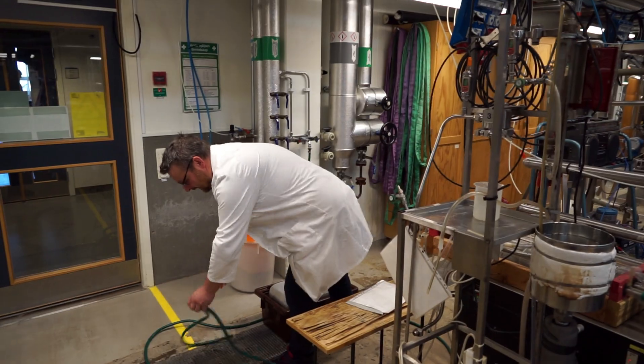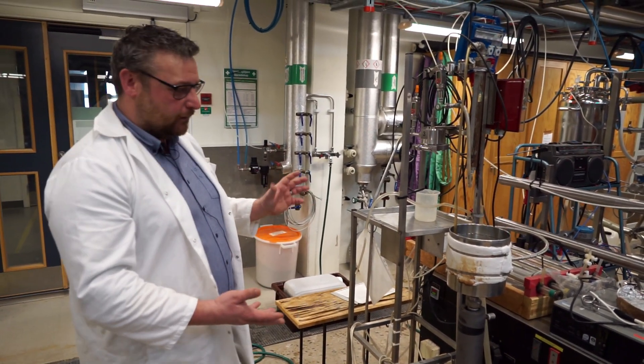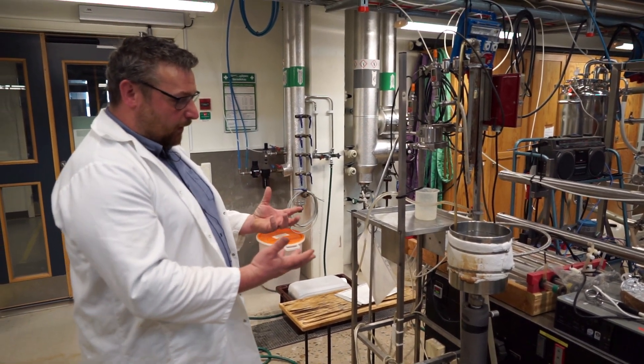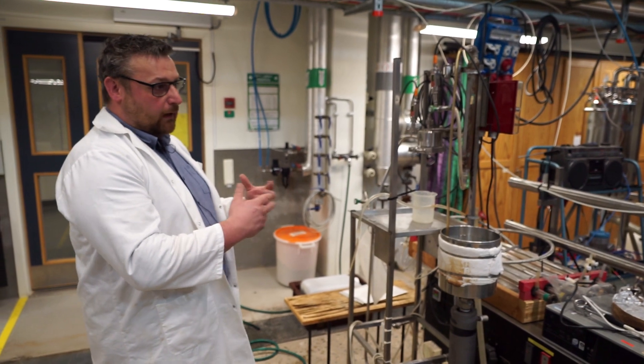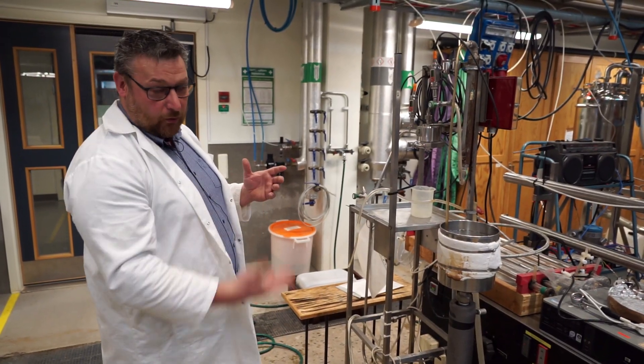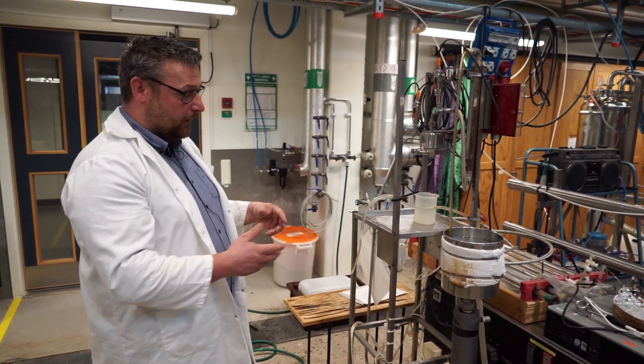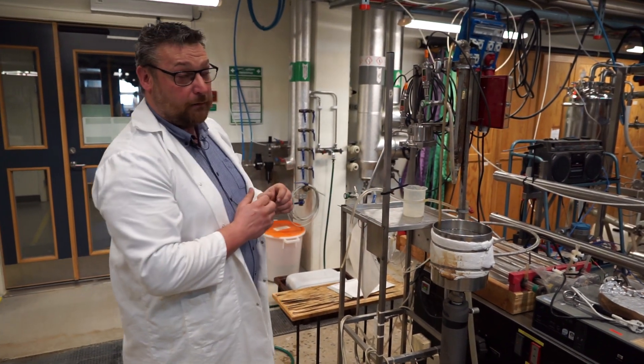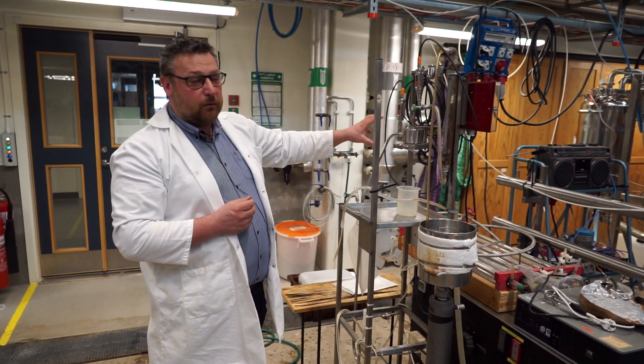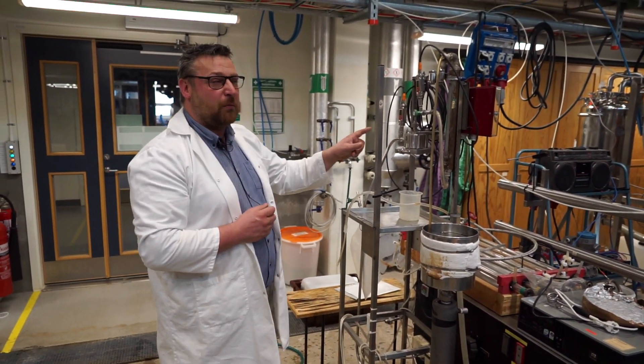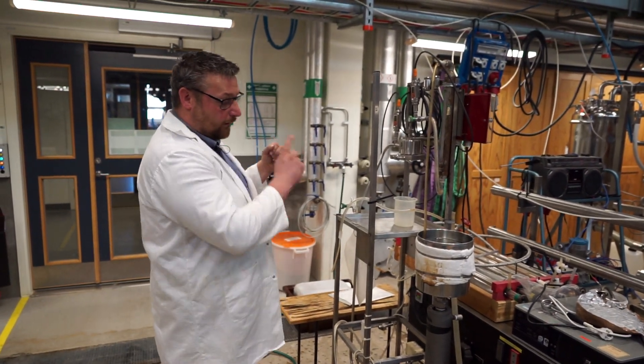So why do we recirculate anyway? Well, in a small laboratory setup like this, this is what's called a batch membrane filtration. So typically when you work with small amounts of liquid, you start with, let's say, one or five or ten liters of solution. And you want to investigate what happens when I withdraw permeate from this. The permeate having a different composition than the media that we have on the retentate side. So some components in our feed solution will be concentrated just as it passes through the membrane. But only to a really, really low degree the first time it passes by. Because this flow is much, much greater than the flow that will go through the membrane. So we need to do it basically over and over and over again.